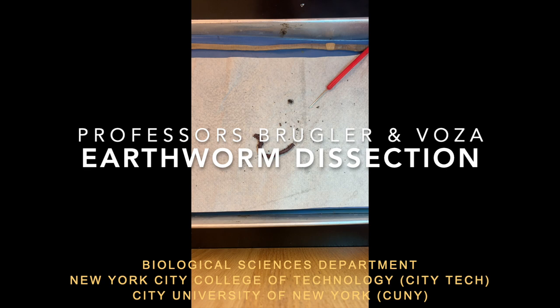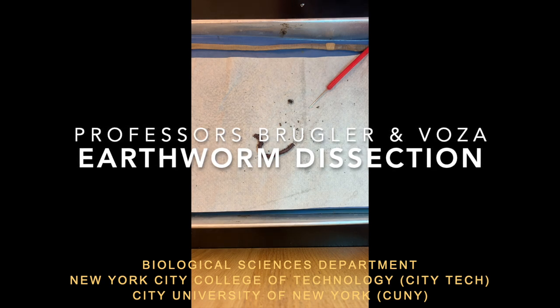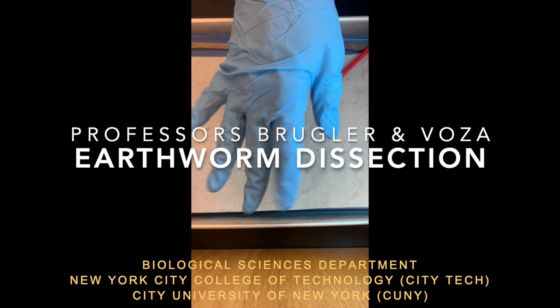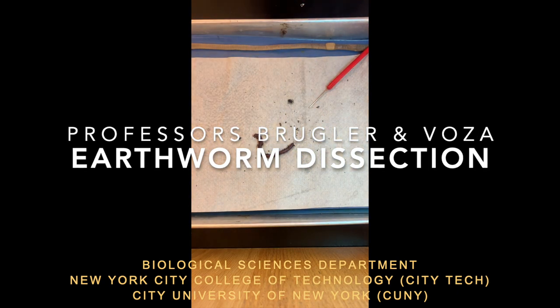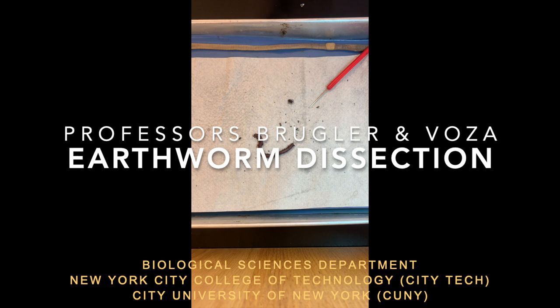Hi, we're from the biological sciences department at City Tech. I'm Professor Vauza with the blue gloves, and I'm Professor Brugler with the other blue gloves. Today we're going to dissect the earthworm.